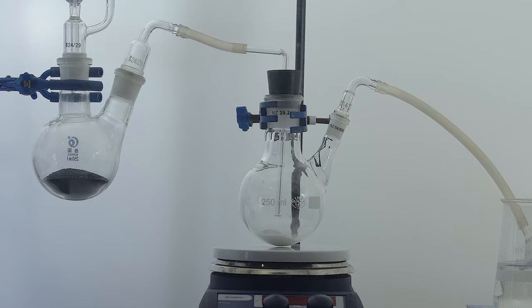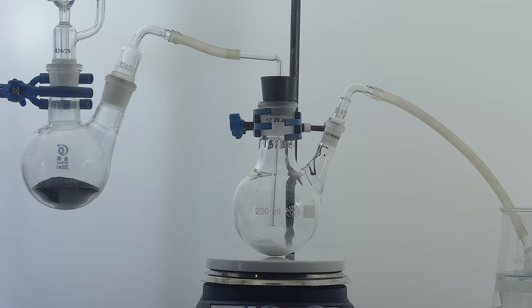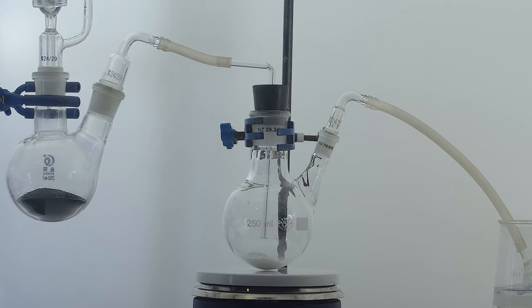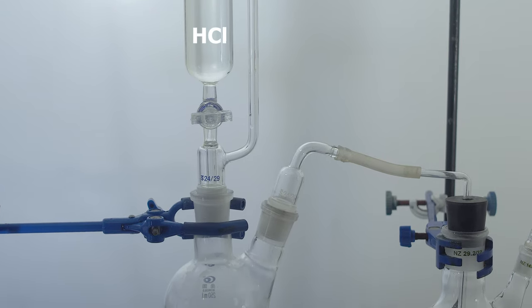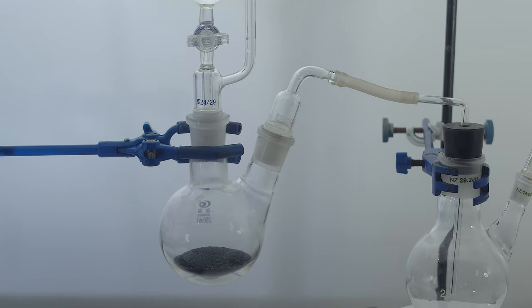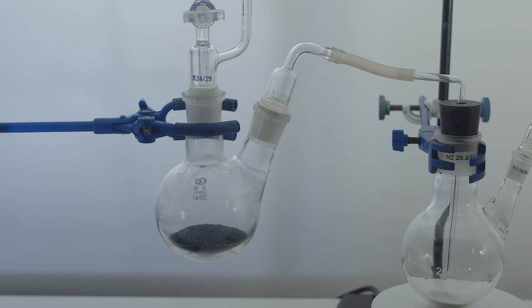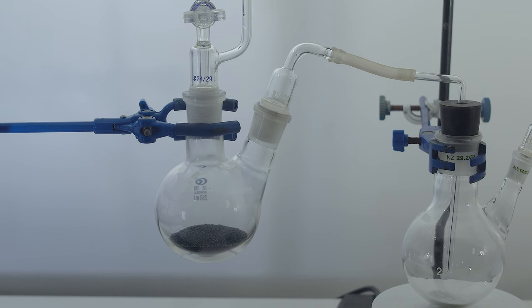Lead tetrachloride can be acquired from chloroplumbic acid, that results from bubbling chlorine in the solution of lead dichloride in hydrochloric acid. This setup for synthesis includes a flask with potassium permanganate, where we'll produce chlorine, and then we'll feed it into another flask with lead dichloride and hydrochloric acid.